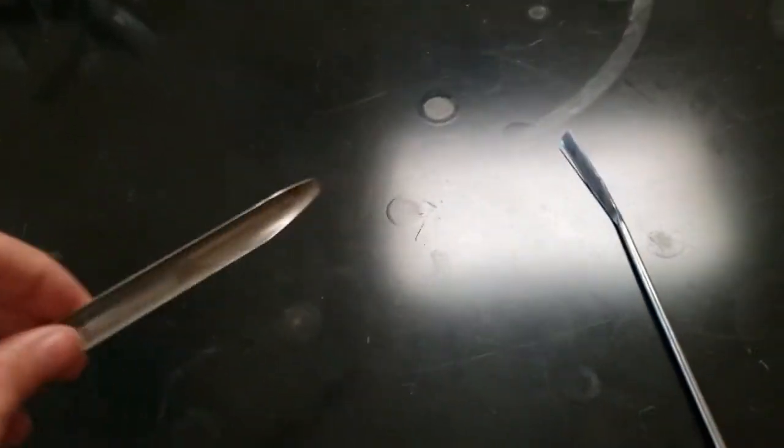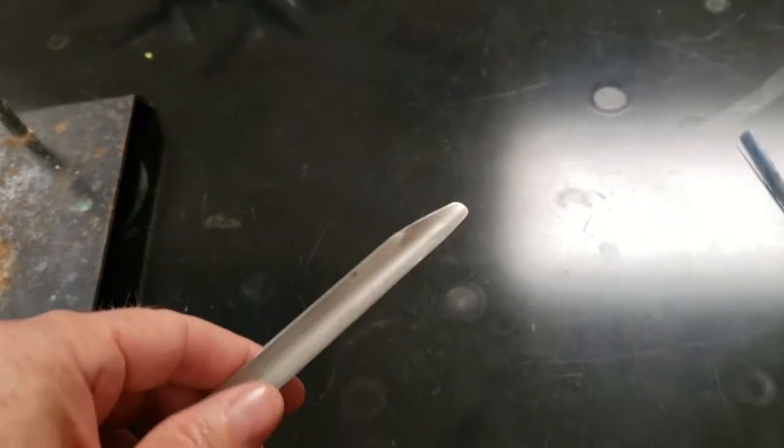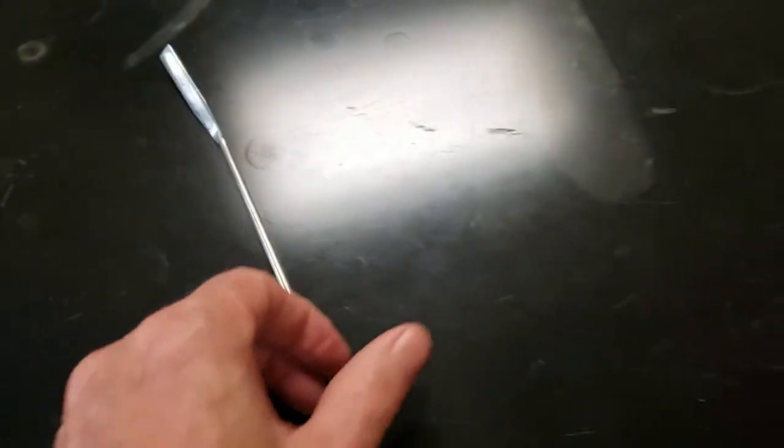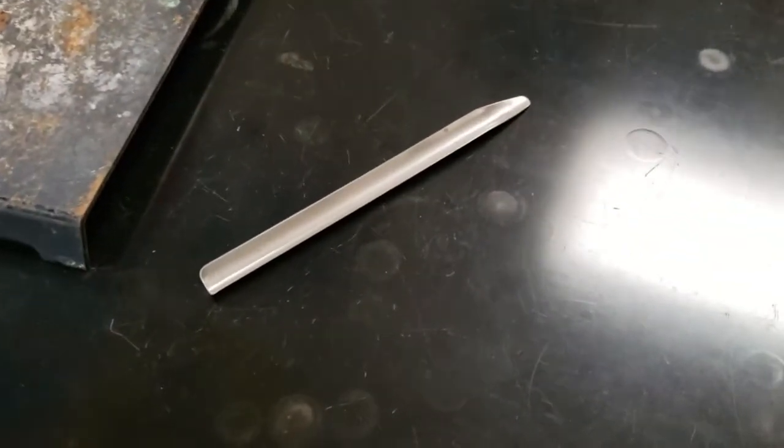This is a scoopula. It's spelled scoop and then U-L-A, scoopula. It is the most useful for the money. This is a spatula and has a spoon on the end, and they work well too, but I still like the scoopula better. It's cheaper, but it actually functions better.